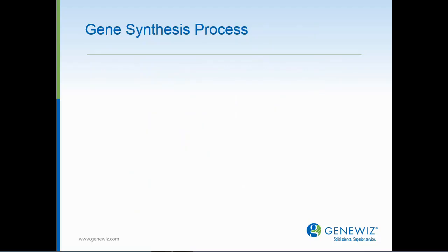So what exactly is gene synthesis? Again, let's take a moment to define the process. Gene synthesis can be defined as the de novo synthesis of any DNA sequence of any length and can be placed in any vector backbone. This technology allows for the easy manipulation of nucleic acid sequences that correlate to the intended protein of interest.